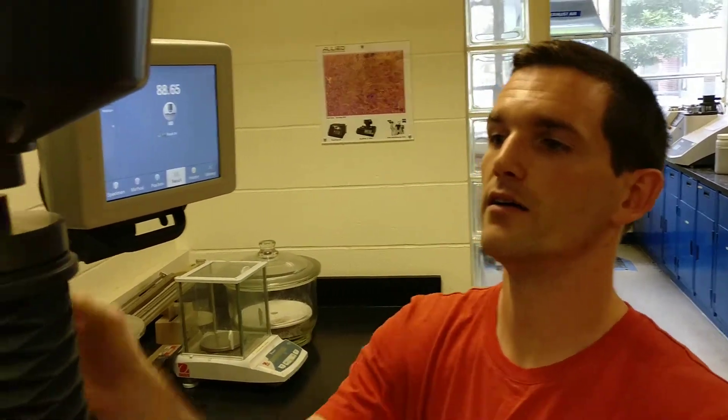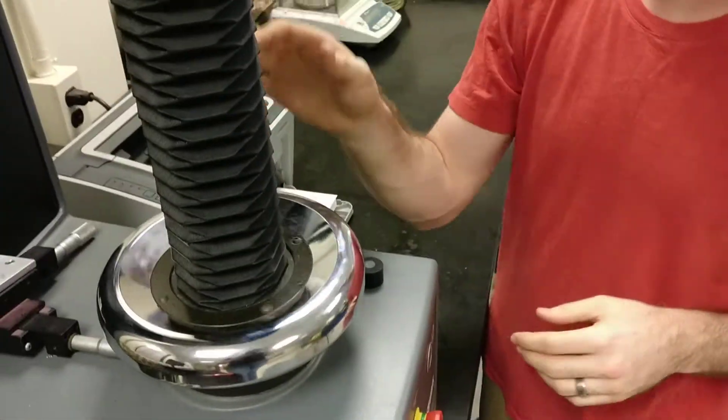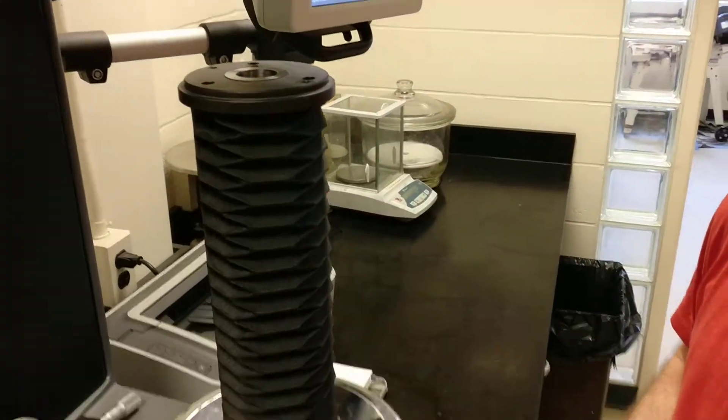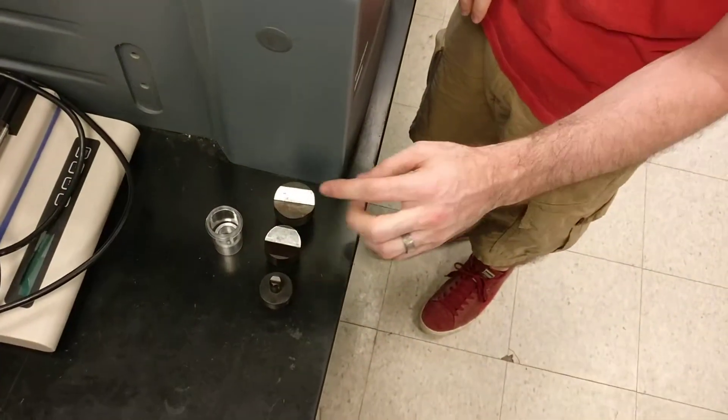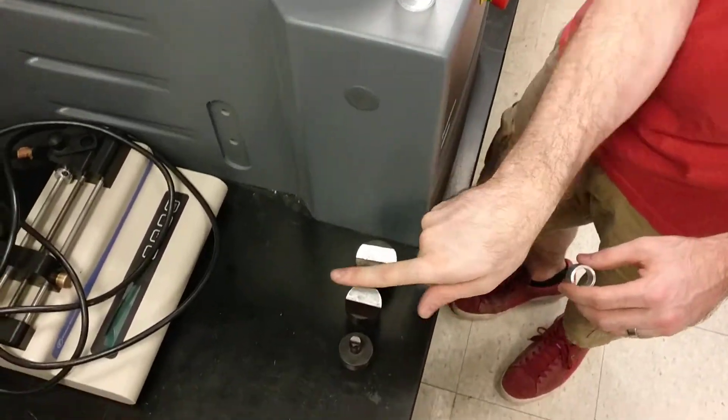Take three measurements and do an average and standard deviation of that. If we have samples that are not flat, we also have an adapter — you can take this off and store it in the drawer underneath the hardness tester. We've got a ring and a couple of adapters for different diameter cylinders.